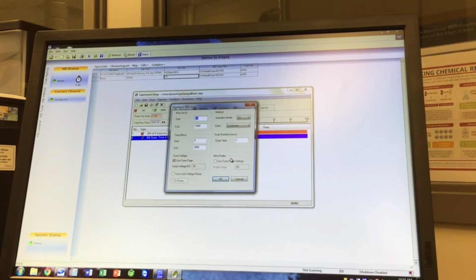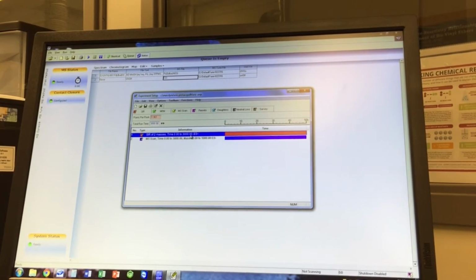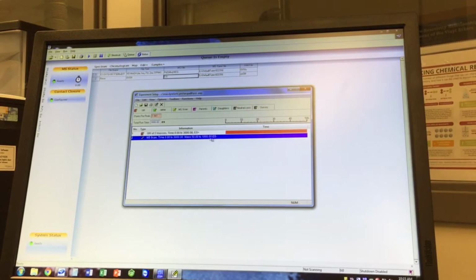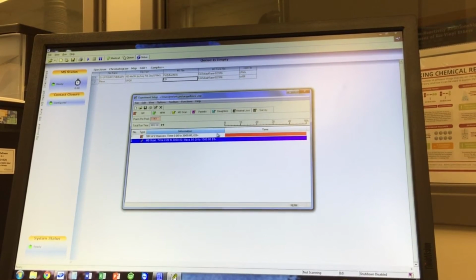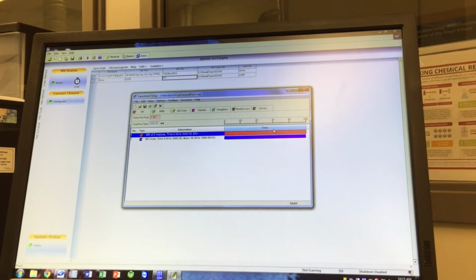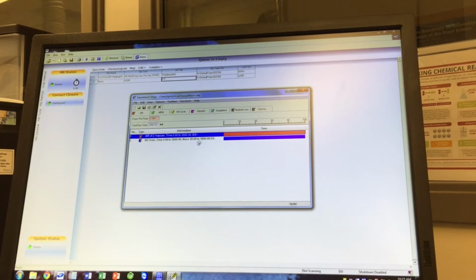And I think the interscan time might be set to something like 0.1 seconds. So this will be 10 milliseconds, 0.1 second interscan time, move to this method, 0.1 second interscan time, and back up to this, and it will switch between these two as the sample is running.